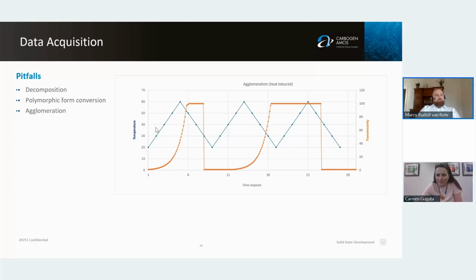So I make 20 slurries, let them shake overnight in a shaker, centrifuge, take the supernatant, make a quick HPLC with a calibrated HPLC method, check the solubility, and do the same thing at 40. Sometimes you always see the same candidates, like very unpolar ethers or heptane.